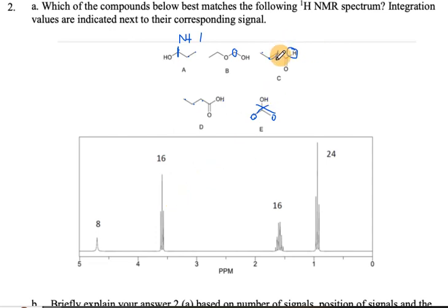Let's look at that of this center alone too. For this center, we have 1 here, then we also have 2 here. So n in this case is 3, and 3 plus 1 is 4, which is a quartet, but there is no quartet splitting pattern here. So this one too is not a possible candidate of this spectrum. Therefore, the D is the correct one. Let's test for the D. We have the splitting pattern. Let's say we have this one.